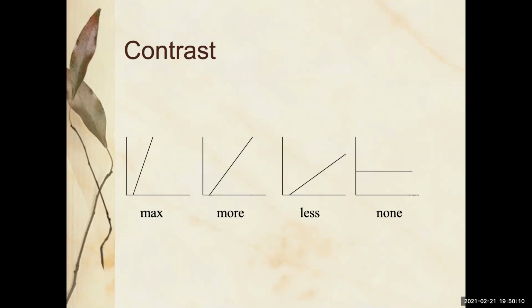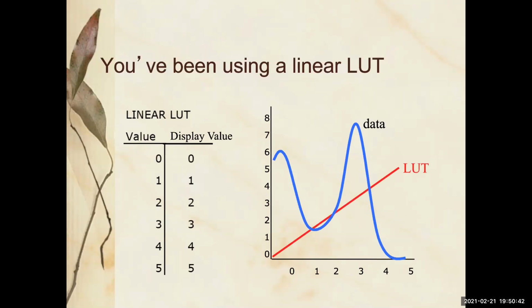You never know, though. And then I think I showed you in the live video that you can flatline it. Just play around with it so there's no contrast. Obviously, that's not useful. You just wiped out your image. But play around with this on Fiji with the images you have. Grab the lookup table and mess with it until you have that gut understanding of what the lookup table is doing to your image, or how it's displaying it.